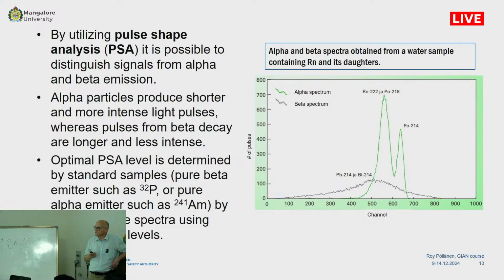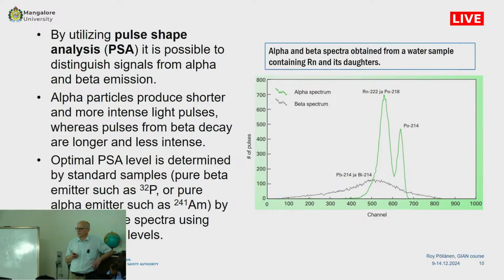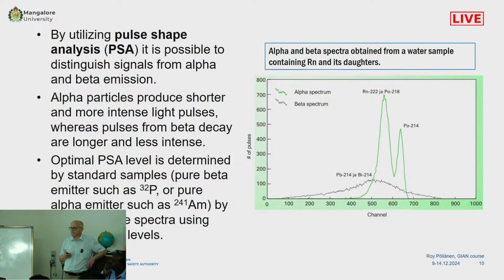Again, the scintillator cocktails are quite expensive. In order to analyze polonium, if you use the digestion method, it is not that costly. But if you have to use the liquid scintillation counter, then it is very expensive.